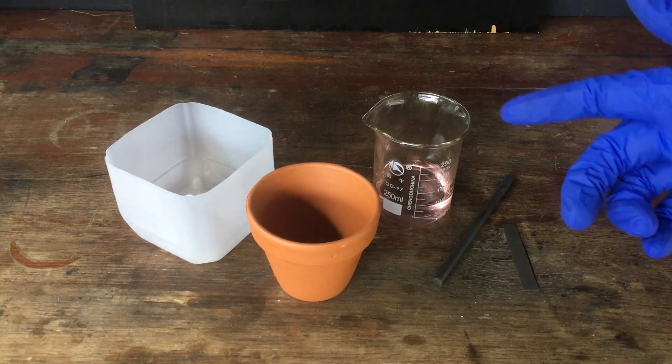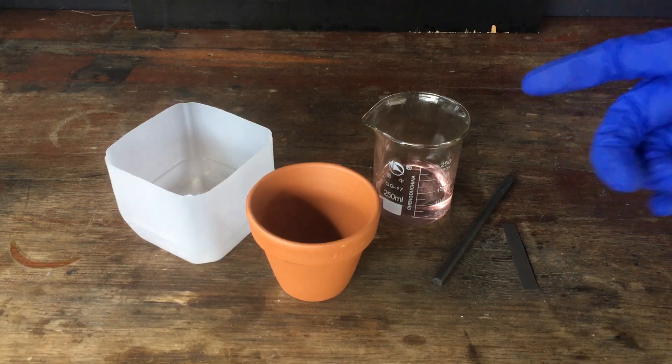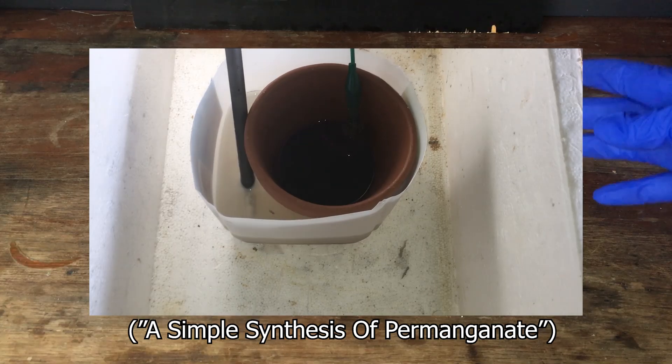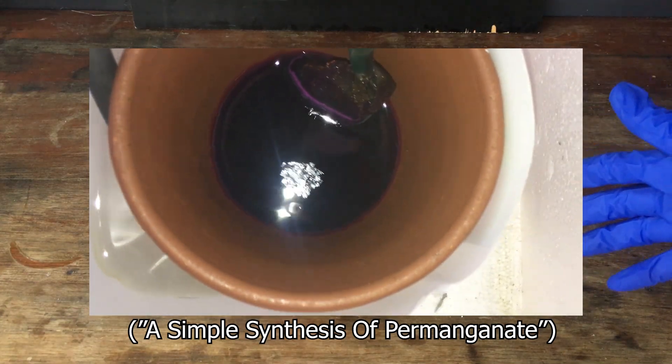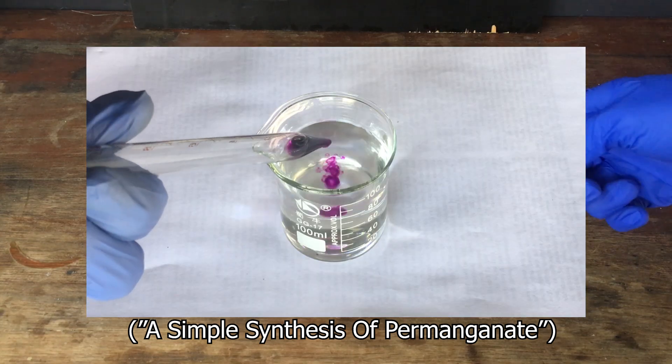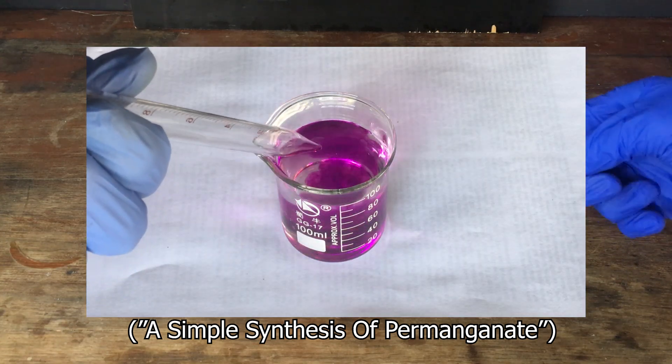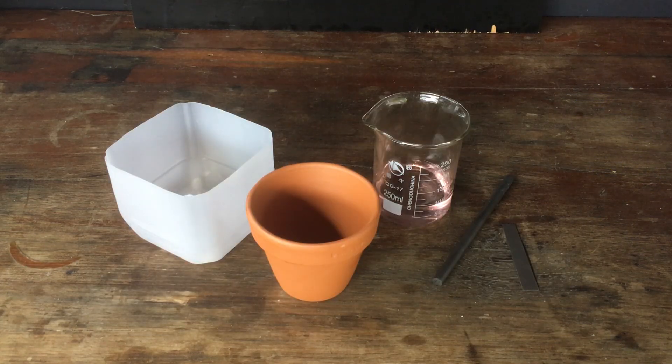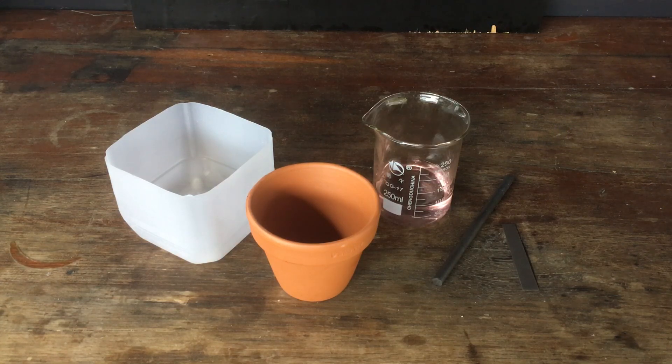If you remember a fair while back, maybe eight or nine months ago, you'll remember that we made a video about generating potassium permanganate from manganese metal using electrolysis. This was one of my favorite videos I've ever done on the channel, and I really want to revisit the project because there were a couple of things I didn't like about that synthesis.